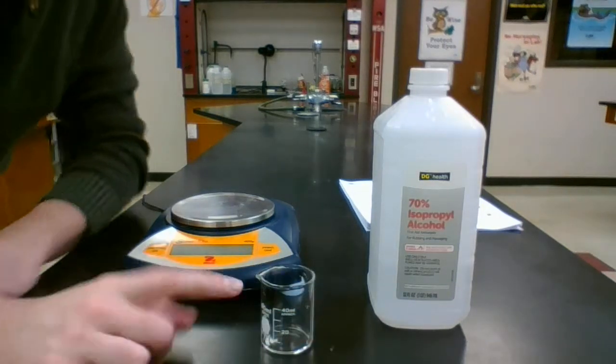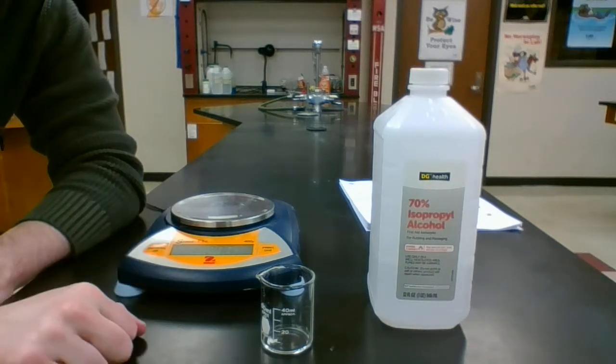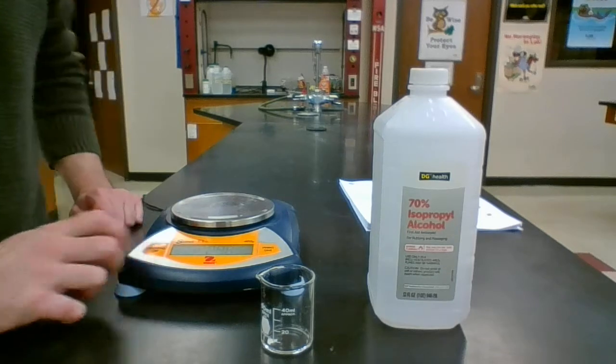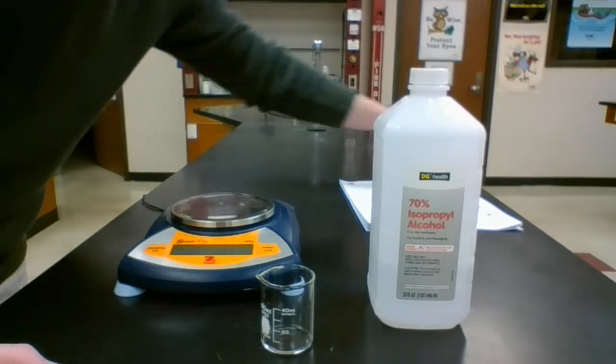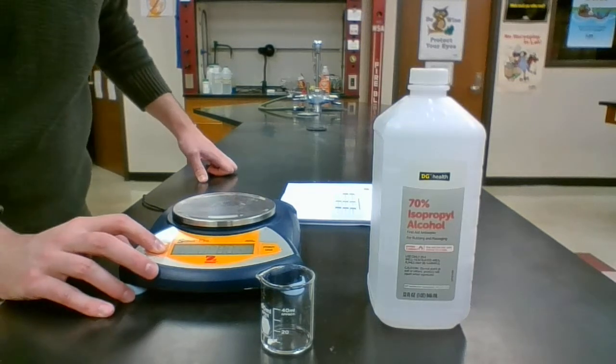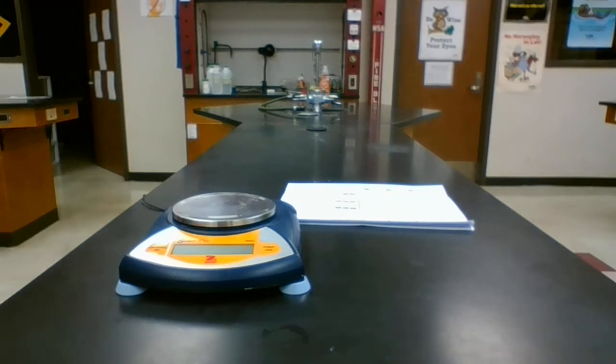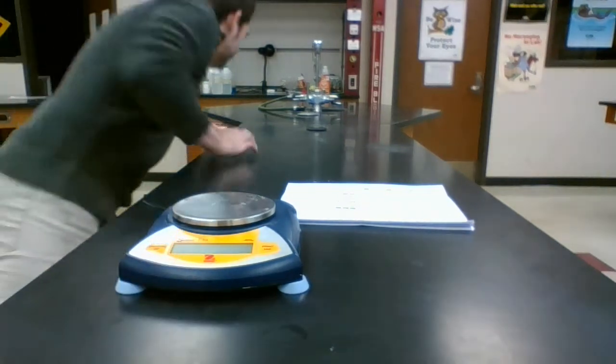Depending on how much rubbing alcohol you got in your beaker, answers might be a little bit different, but they all should float around the same answers. Okay, so I've got that poured out. Turn my scale off and move my stuff. And we can move on to the next station.